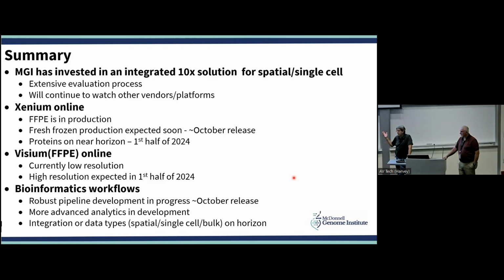We've only got a limited number, so I thought I had the numbers in here. We've run 7 projects so far on Xenium. We've run 20-something projects on Visium, but it's not been a huge swath of tissue types. So obviously we have tested in the space that we've worked, and so far what we've seen, especially the new workflows that we've been looking at, and with the latest software from Xenium, the cell segmentation is quite a bit better than it was before. Yeah, and the new advances in the segmentation are coming probably beginning of next year.